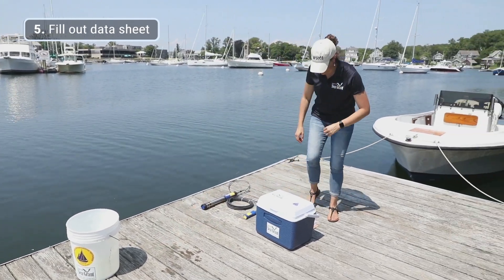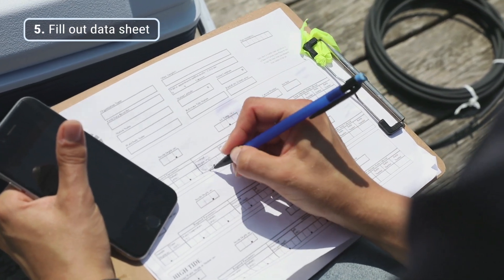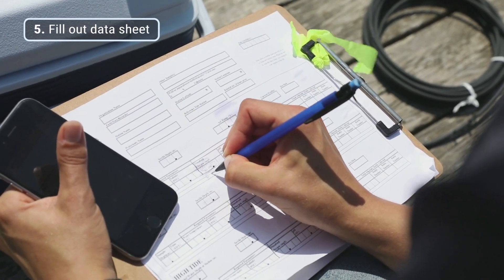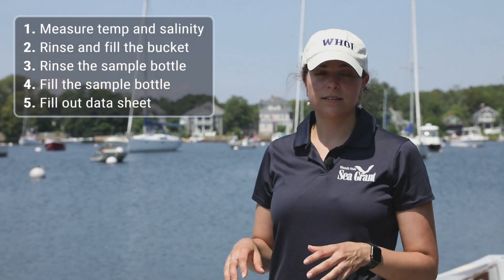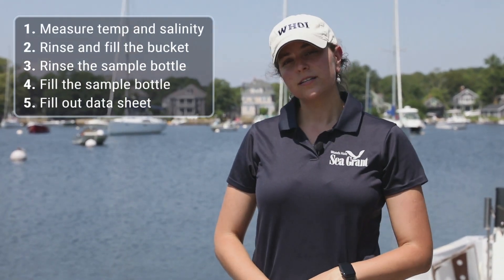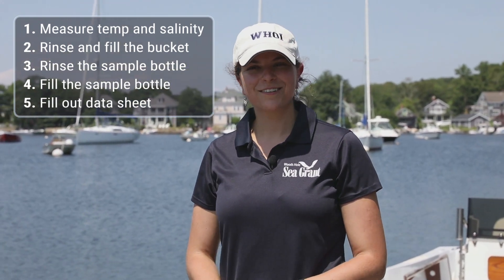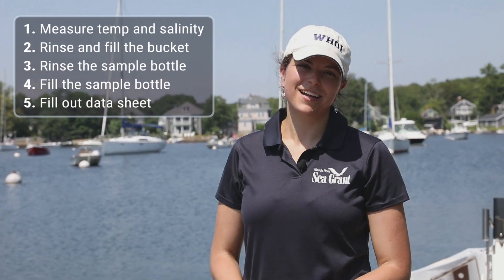Then we're going to fill out the rest of our data sheet with our temperature and salinity information and our bottle number. The sample will be stored overnight in the dark in your cooler and transported on August 23rd to the participating lab open house for dropping the sample off. Thank you for participating in Shell Day 2019.